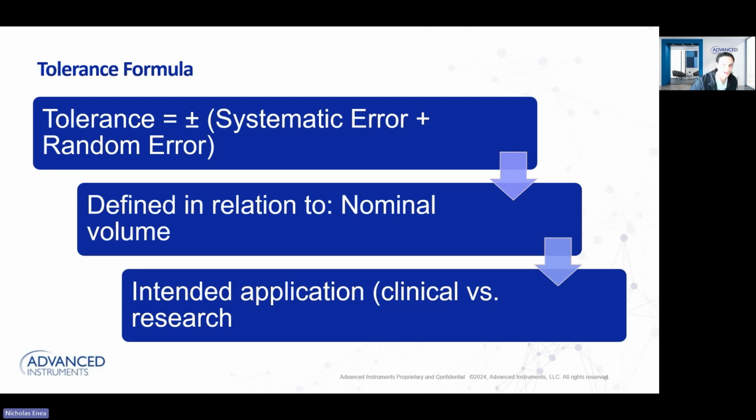All right. Let's get back to what we were talking about. We've established tolerances, and why we do it, why they're important. Now let's talk about why they're super important applicationally as well. We start with the tolerance formula. We have to understand the tolerances in general for a specific assay or specific workflow I'm working in, whether I'm adhering to a regulatory body, a manufacturer setting, or Artel specific standards as well.